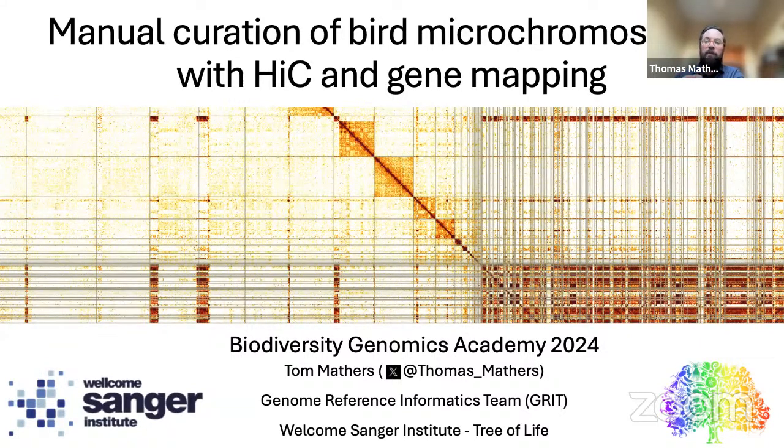It's not so much about the nuts and bolts of how we use Pretext. But if you look in the Discord channel, I've posted an information sheet with a bunch of links to various software tools that are used to create the maps for the workshop and instructions for how to process an assembly using Pretext. So hopefully they'll be useful to help you with those aspects.